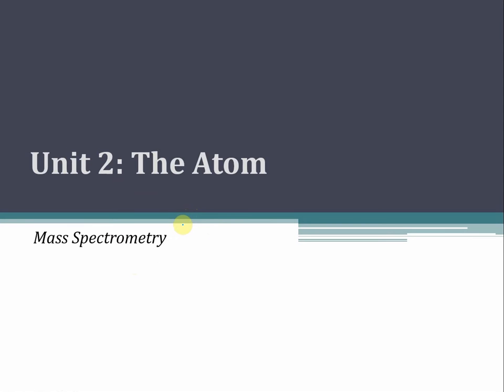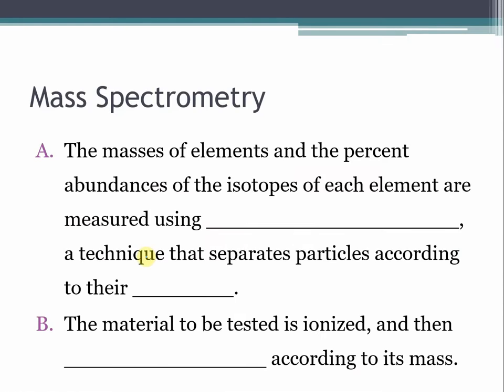Guys, welcome to another round of chemistry notes. In this video, we're going to be talking about mass spectrometry.